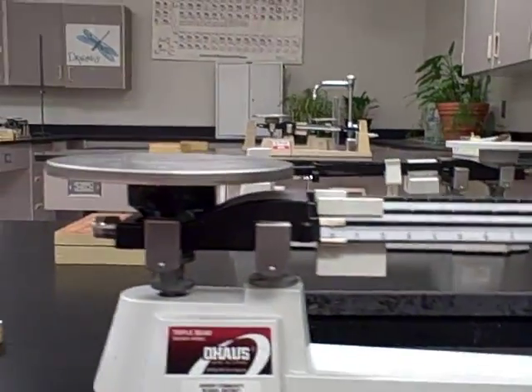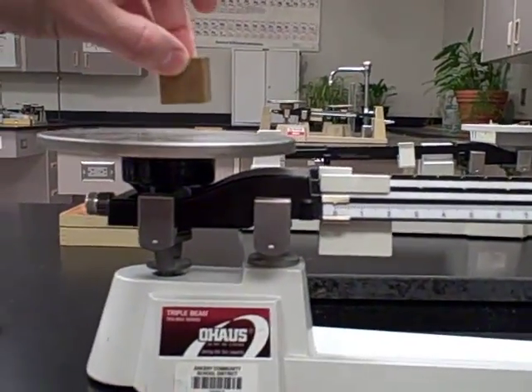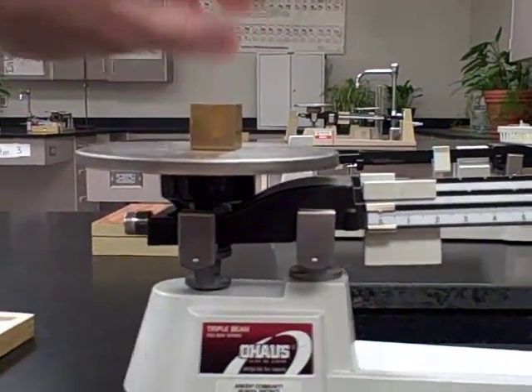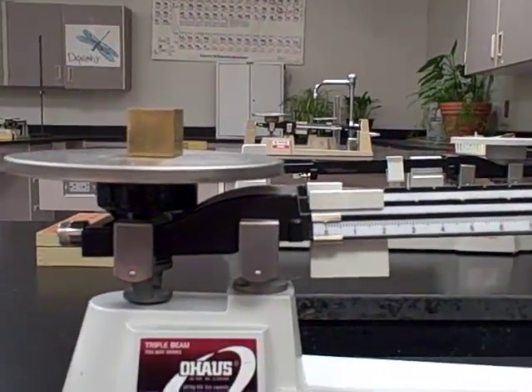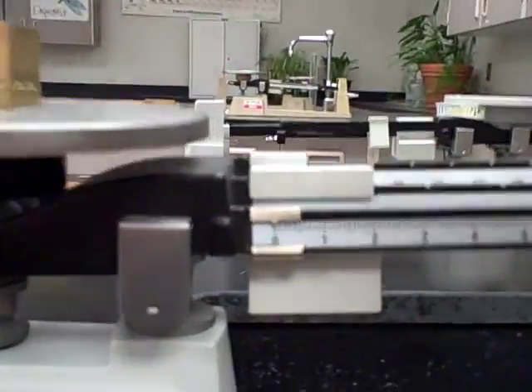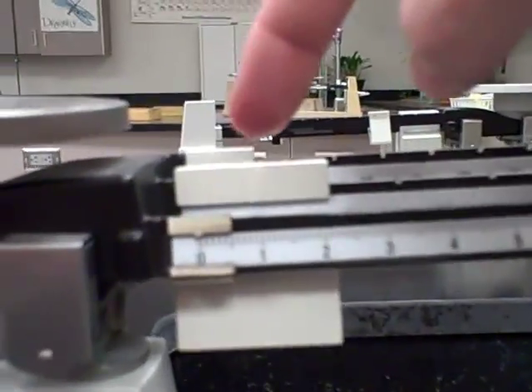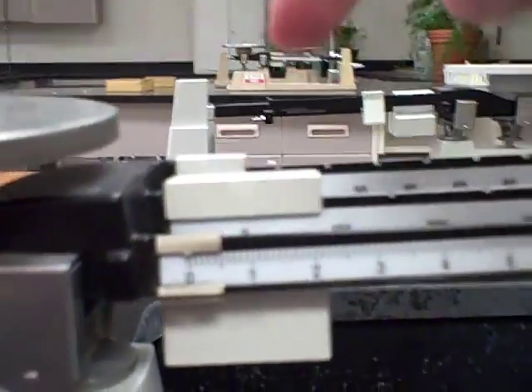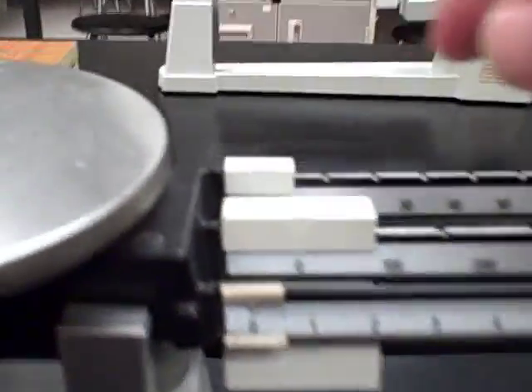You'll use the riders here to figure out the mass. I always start with the biggest one first.